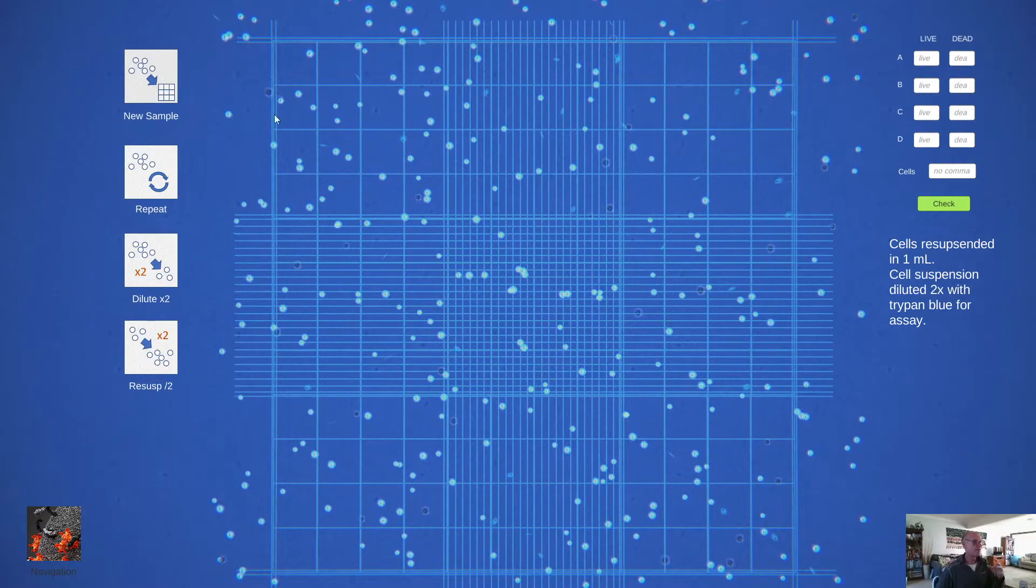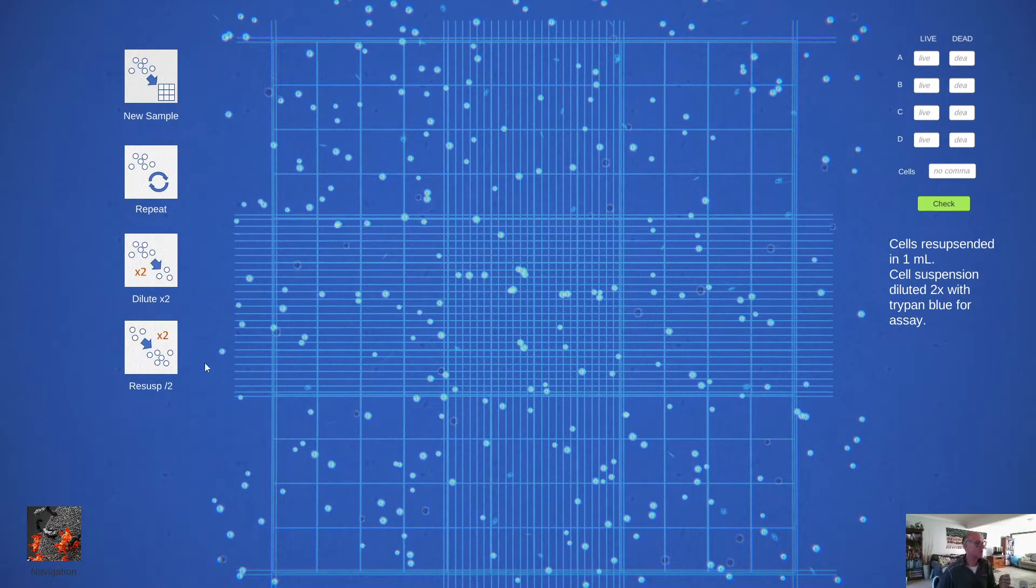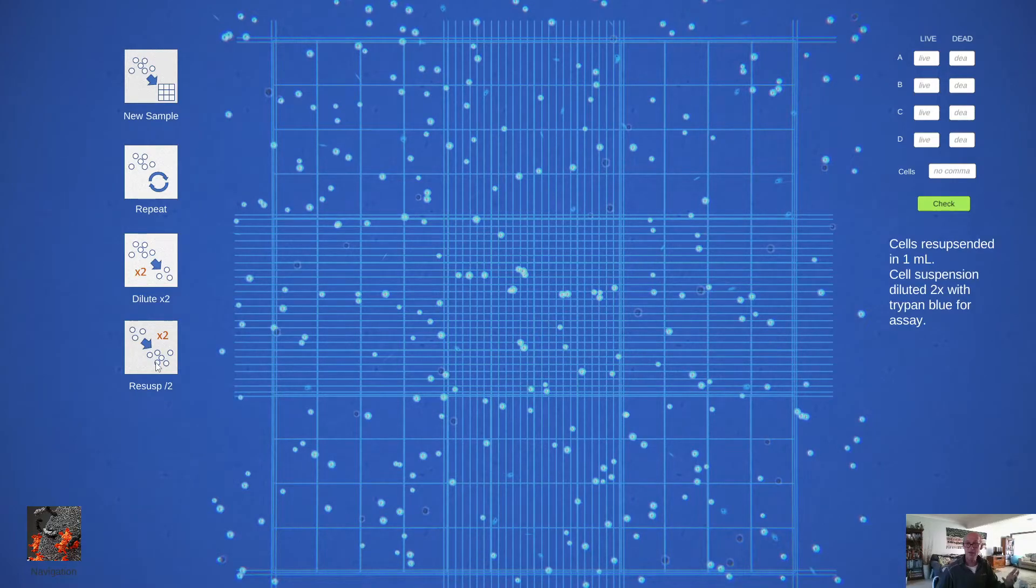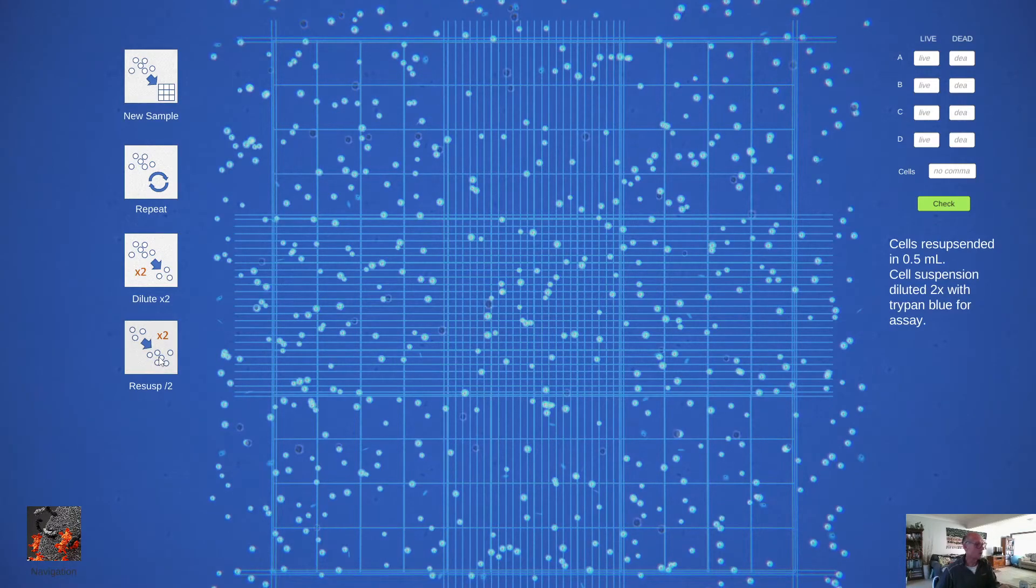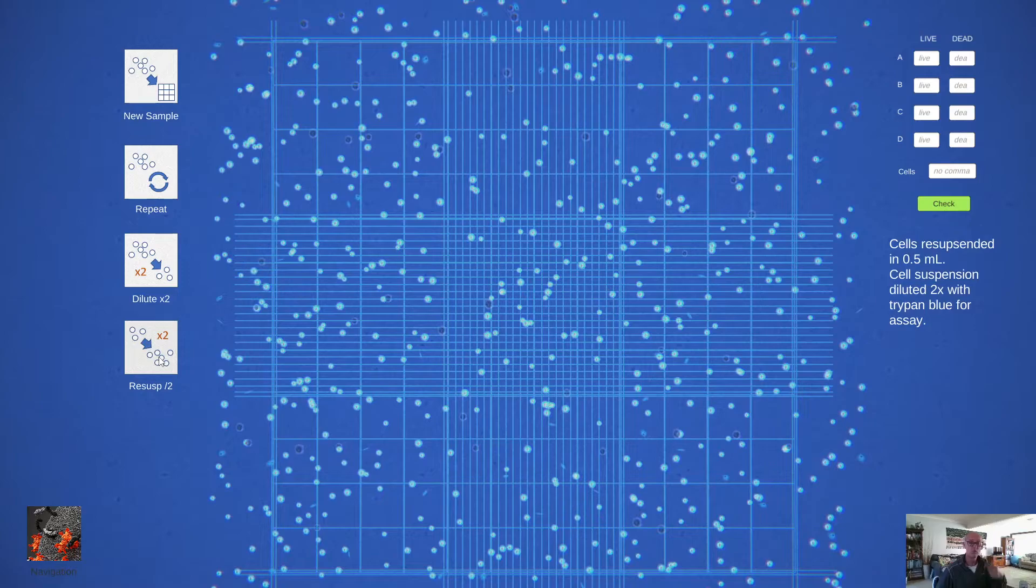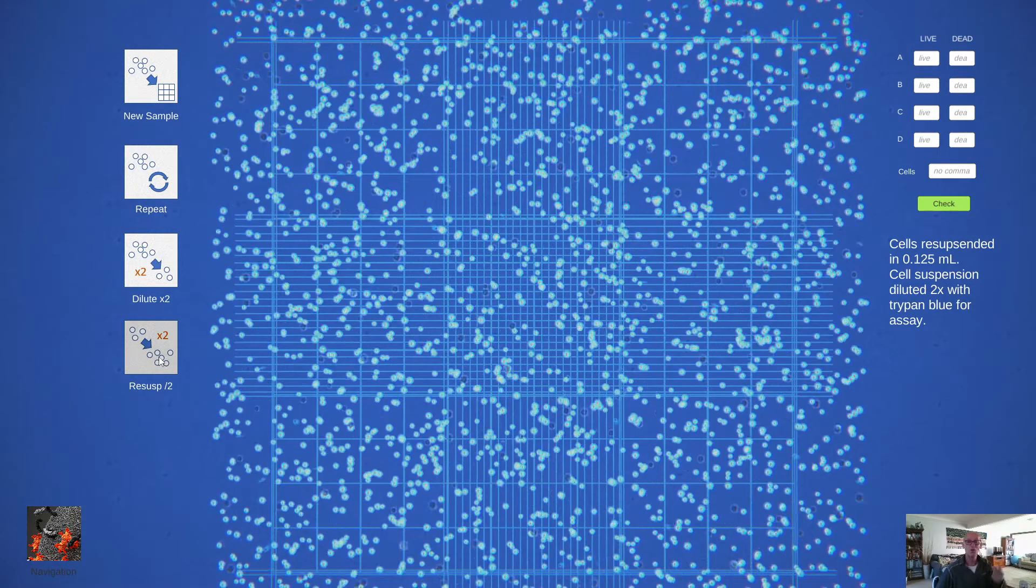Conversely, if you felt that there wasn't enough cells to get a good count, you can re-suspend and effectively concentrate. So that will concentrate twofold, that will concentrate another twofold, that will concentrate another twofold and so on.